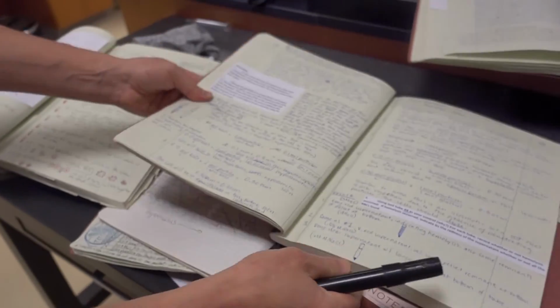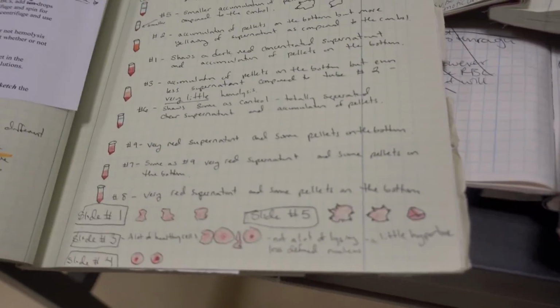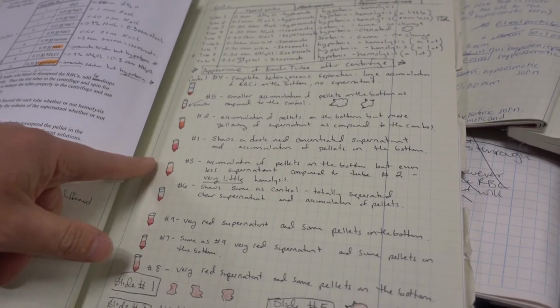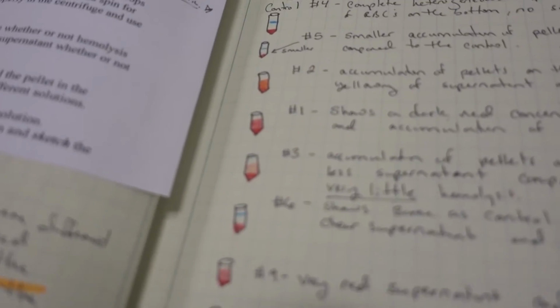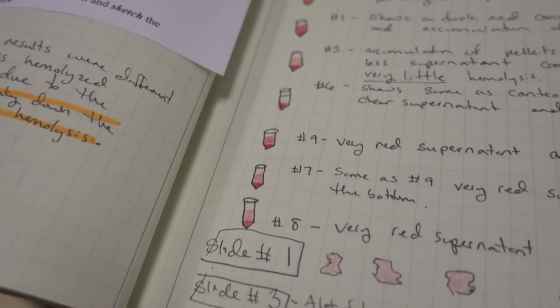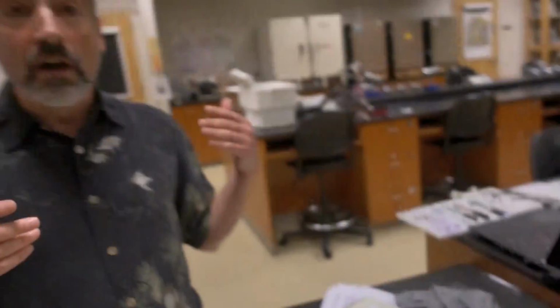When you're done and finally get all your data, you're going to want to make sure you record what happened. And in this case, it's worth recording a picture too. Like when you're taking your lab practical later on in the semester, it's not just about the intellectual content. It's about the actual practice. How did you actually know? Like on your lab exam, you might have a test tube that you look at and you have to decide what happened here. What does it mean? Interpret what happened to these blood cells.